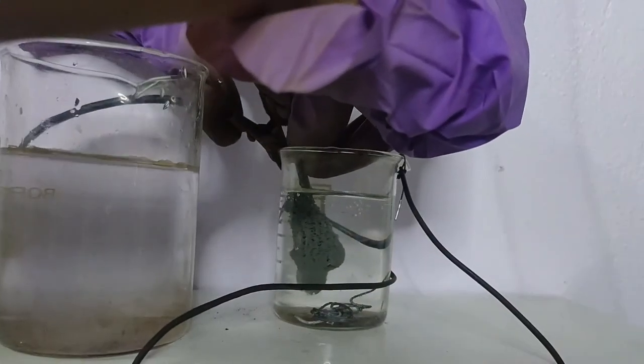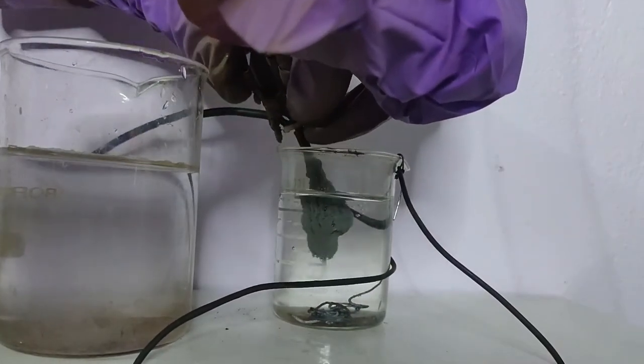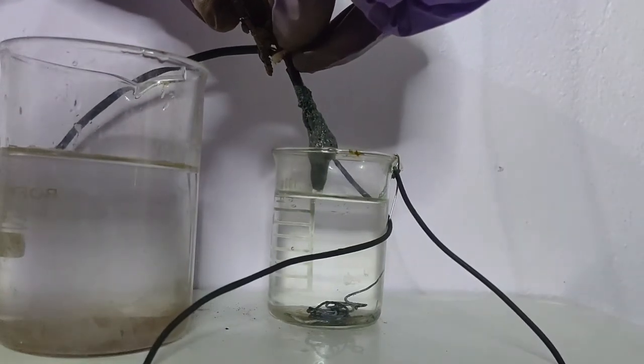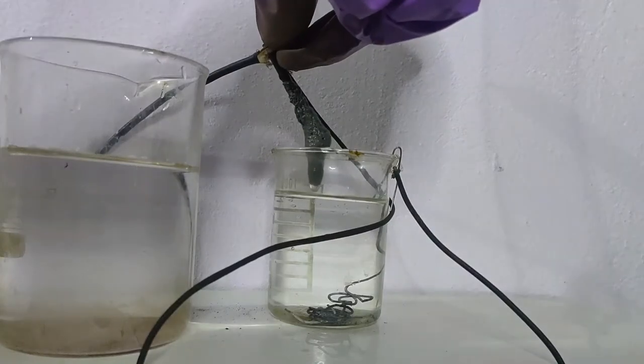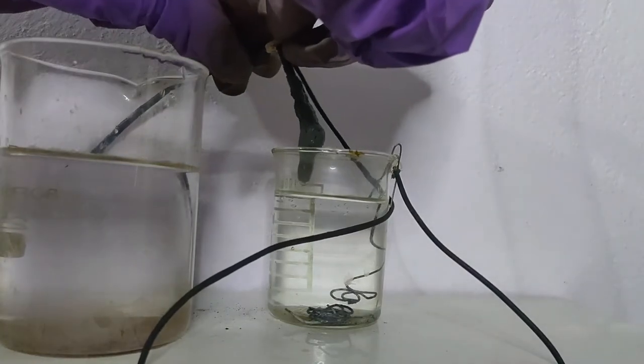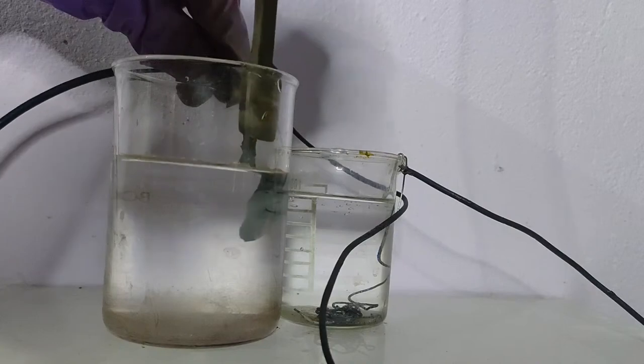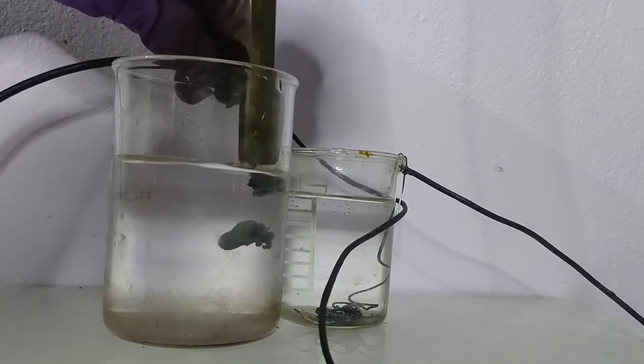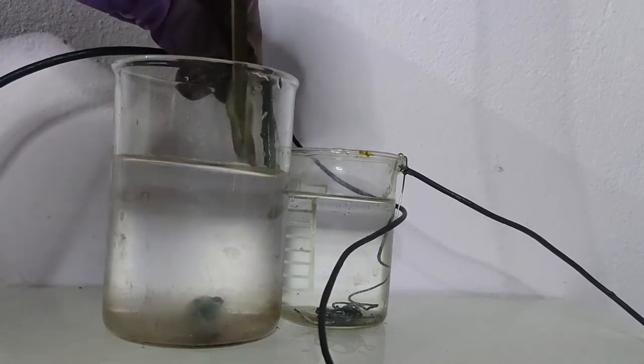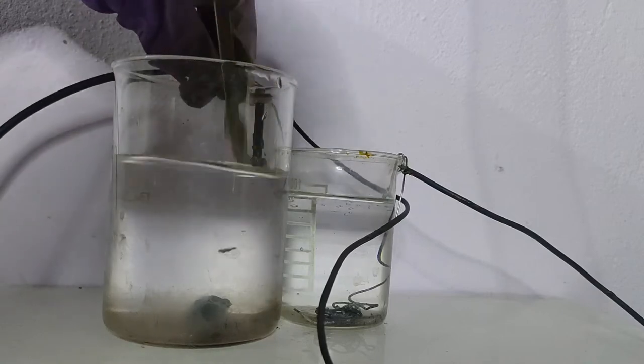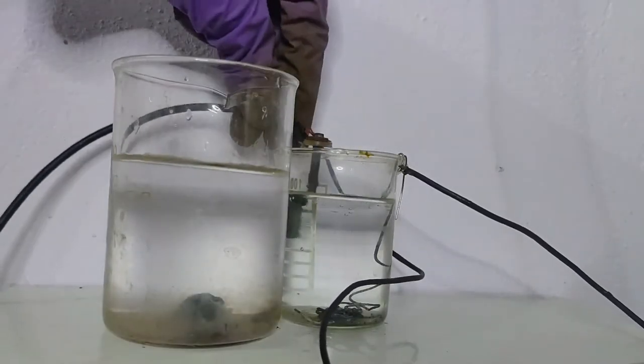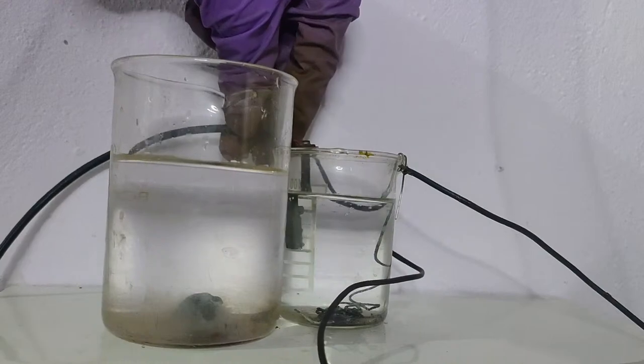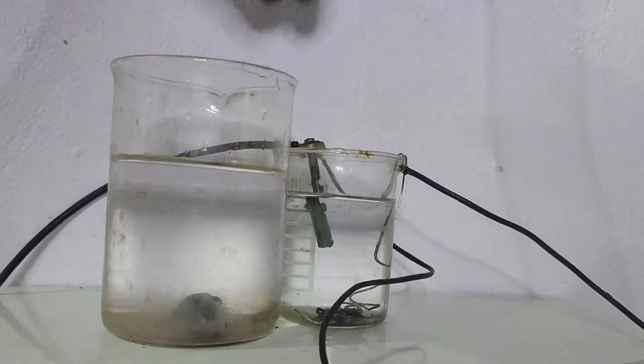Now, after the sponge has grown bigger, I will harvest the crystals. I took out the crystals from the beaker and wash them with water. Then again, put the cathode to get more crystals.